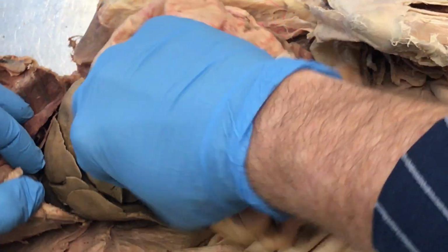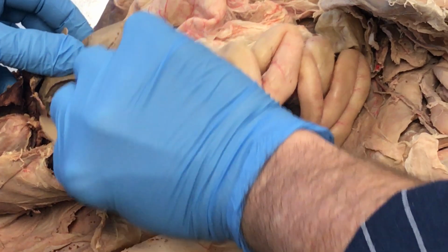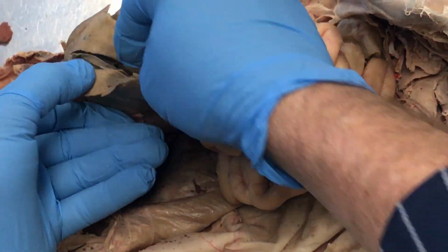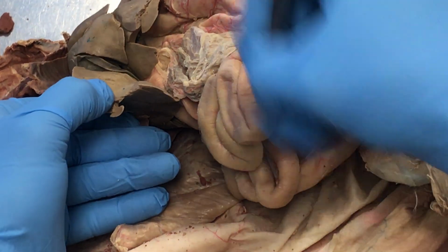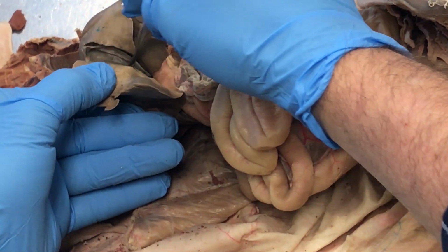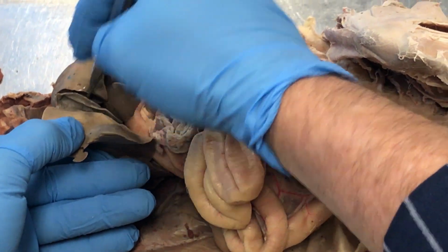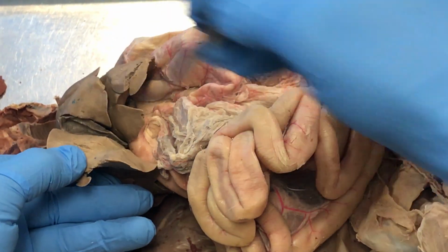Gallbladder. The gallbladder is going to be on the liver. So the gallbladder on this cat is going to be right here. Pull the liver apart, and you can see it right here. Sometimes the gallbladder will be kind of green because of the bile that was in there. It can stain this area, but this one doesn't really have it. So that's the gallbladder on the cat.